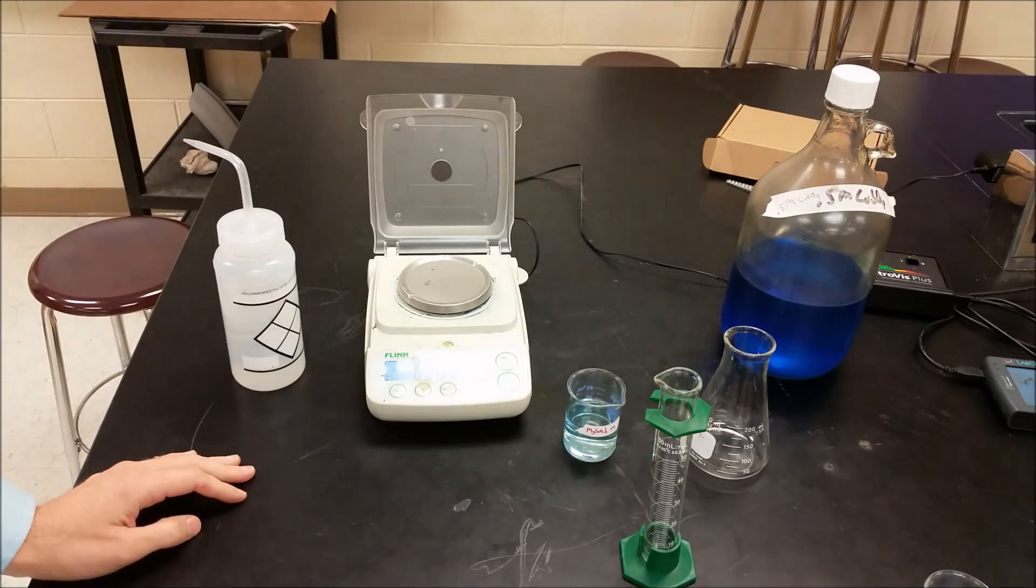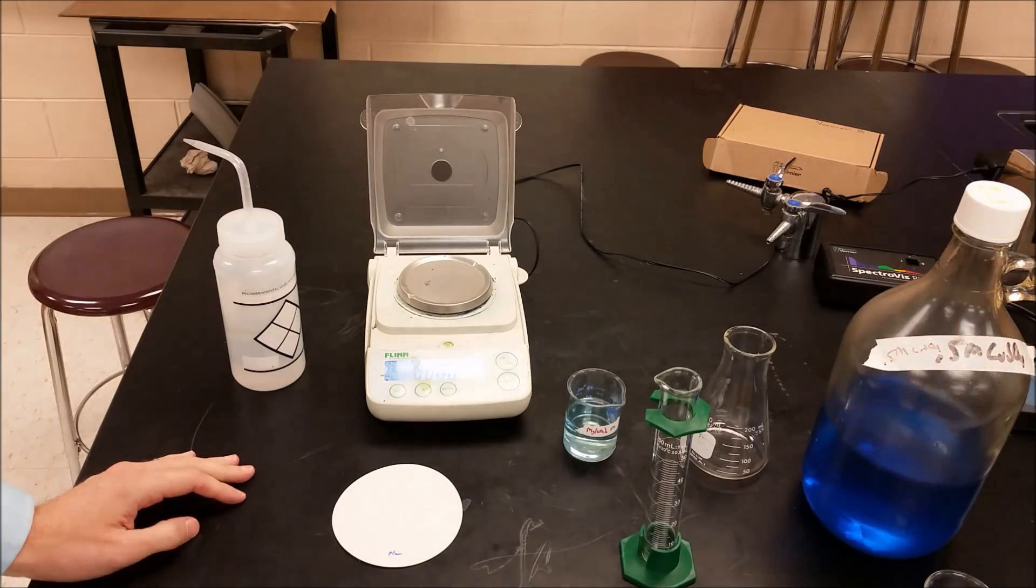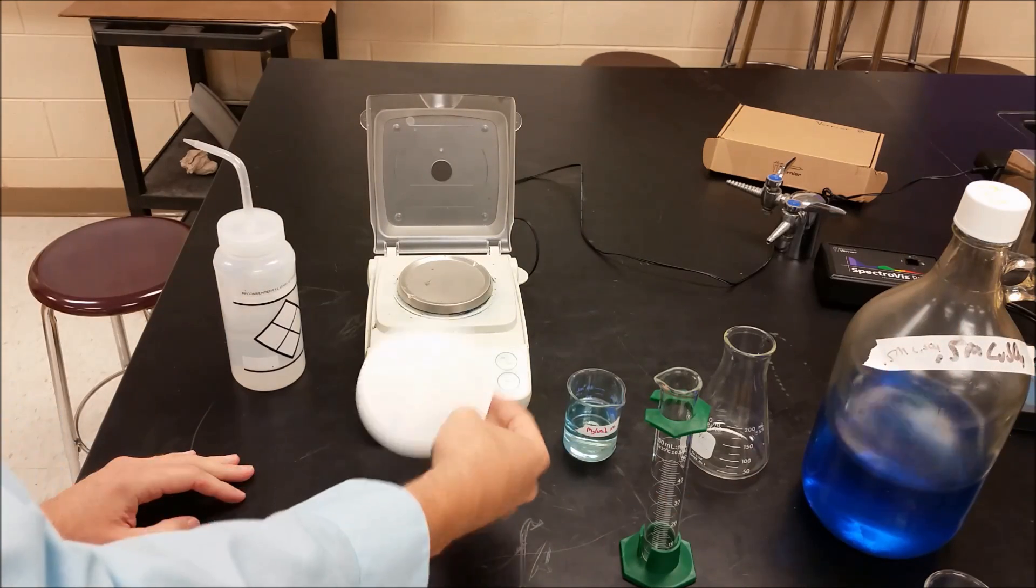One is we're going to do a gravimetric analysis. The other one is we're going to do an absorbance calibration curve using 0.5 molar copper(II) sulfate.